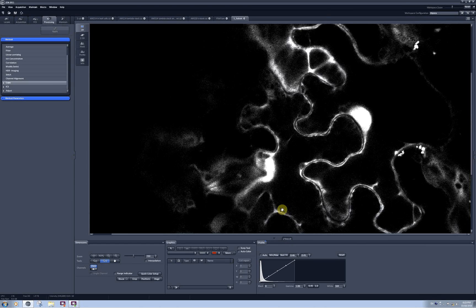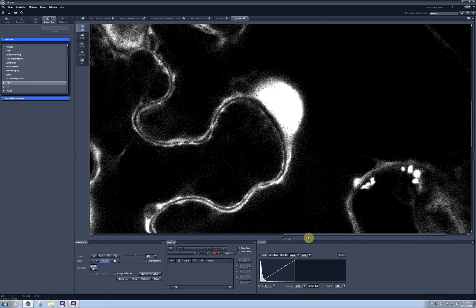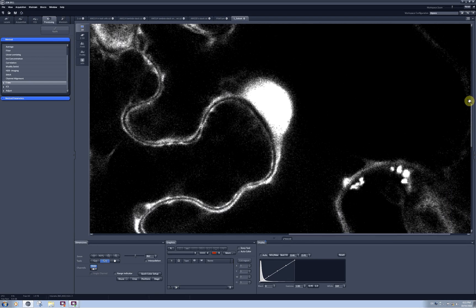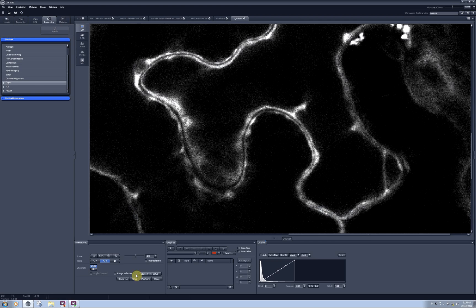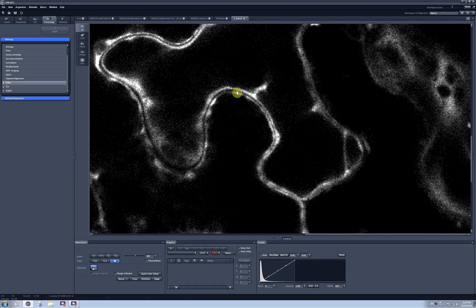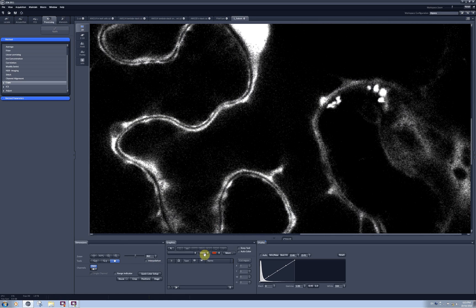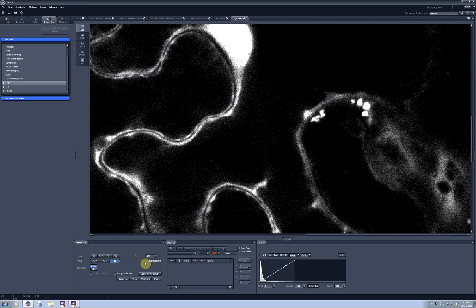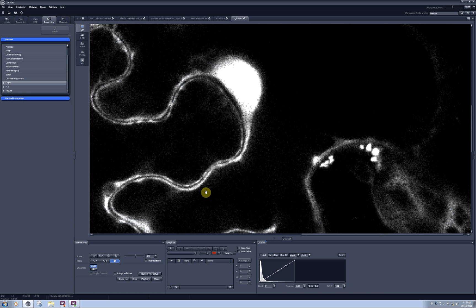You can also zoom in and out of the image by moving the mouse away from you or towards yourself. When zoomed into your image you can either scroll the scroll bars to find the place you would like to see, or use this tool to drag the image around. The checkbox called Interpolation is used to even out the borders between the pixels on your image — it doesn't do anything to your raw data.